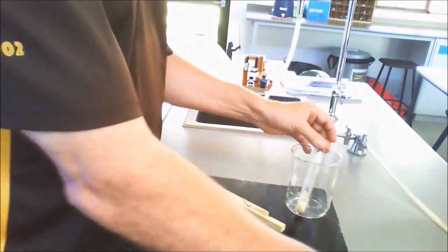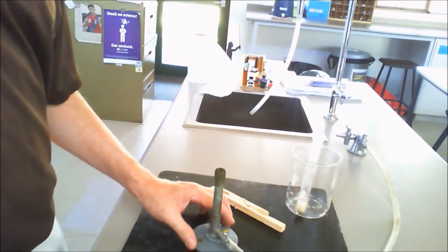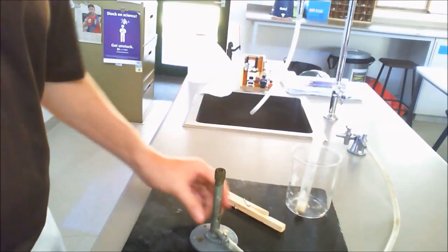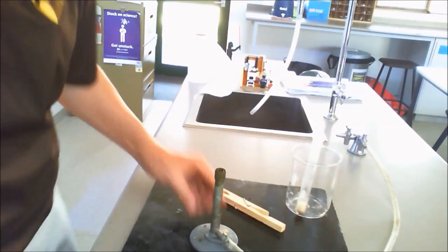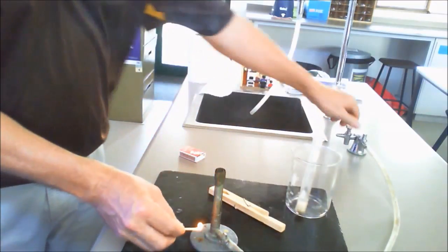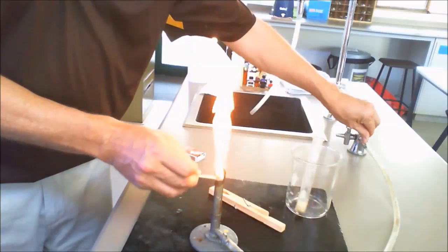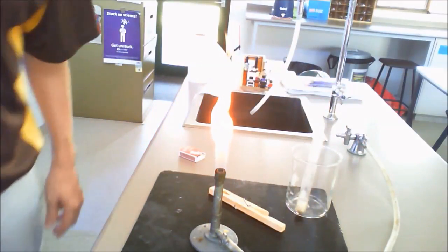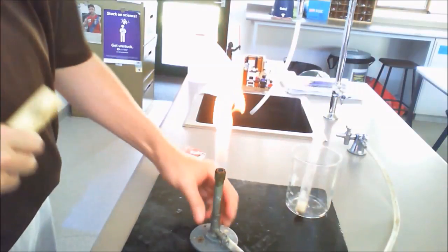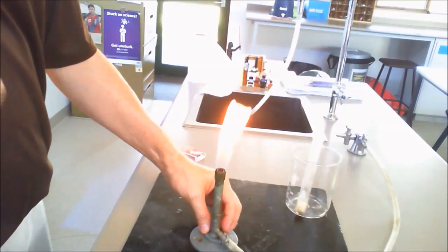Now, obviously, to do this, we're going to be using a Bunsen burner. So, as always, there's a correct technique for lighting the Bunsen. We make sure that the air holes there are closed. We have our safety glasses on. We light our match, we bring that up from the bottom, and we turn the gas on, and you can see there that we have our safety flame, and we'll then convert that to a blue flame when we go through the process of changing the state from a solid to a liquid.